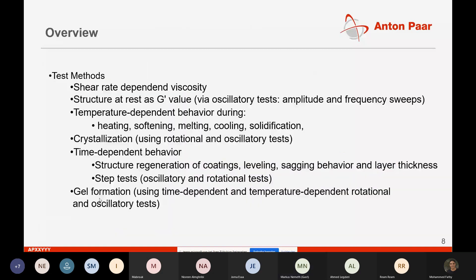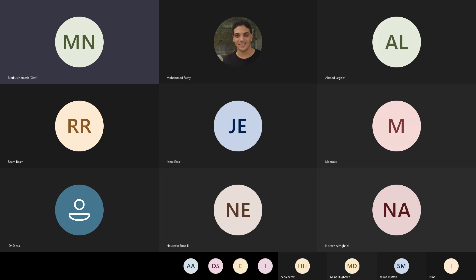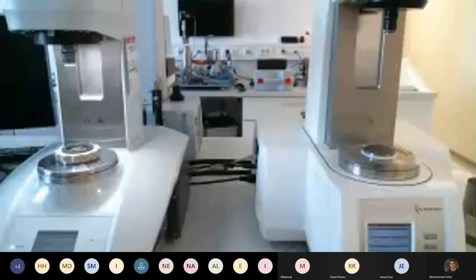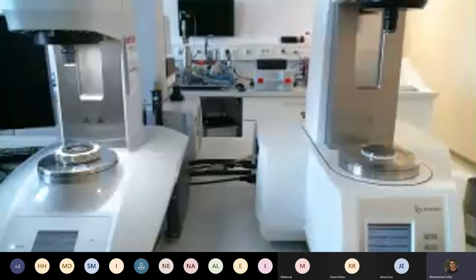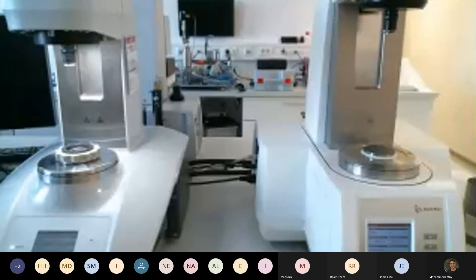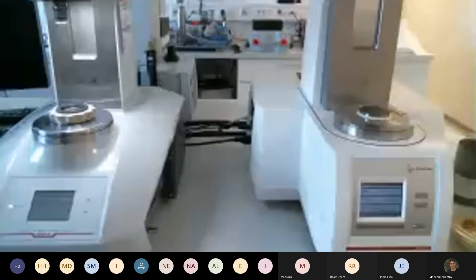Now we have set up our rheometer with our geometries and temperature device. I'll jump to the video screen and switch on my camera. We have here on the screen two rheometers.